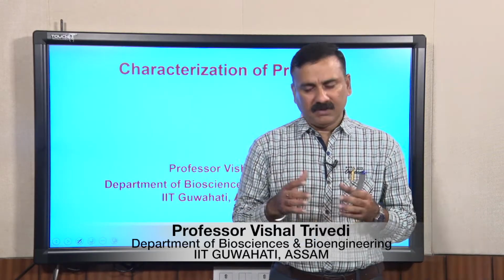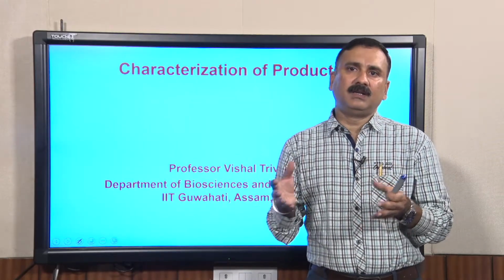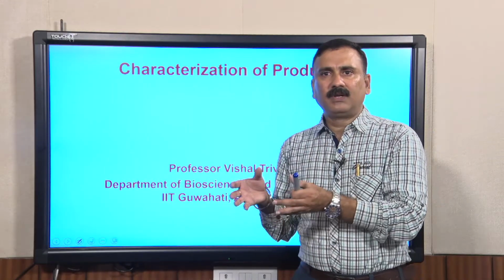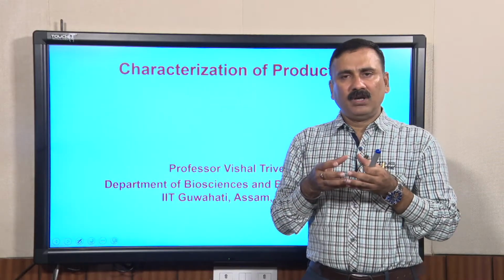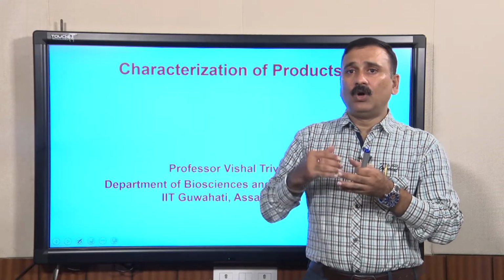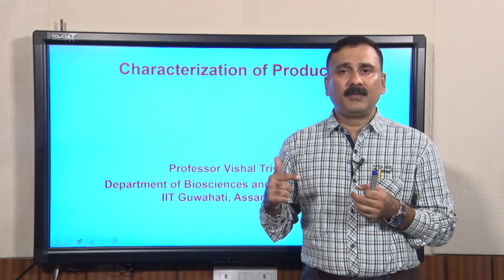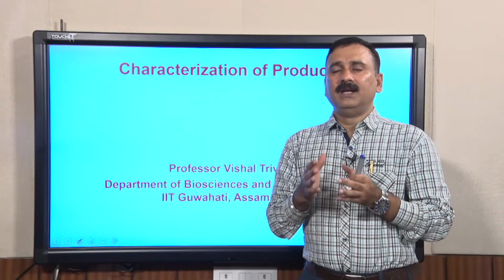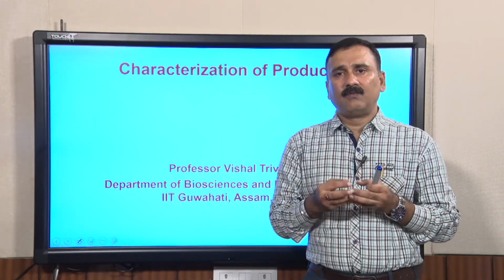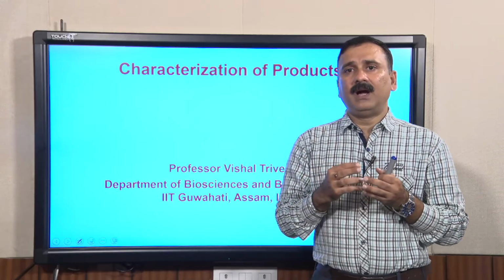And what we were discussing was the characterization of the product that you are getting from the host, either the macromolecules such as DNA or protein, or the small molecules such as different types of metabolic byproducts or the secondary metabolites which you are producing by overexpressing or modulating the environmental conditions or optimizing the production of secondary metabolites. So, one of the crucial factors is that you should be able to characterize the product and know that the product you are getting from these host cells is of good quality and up to the high standards.